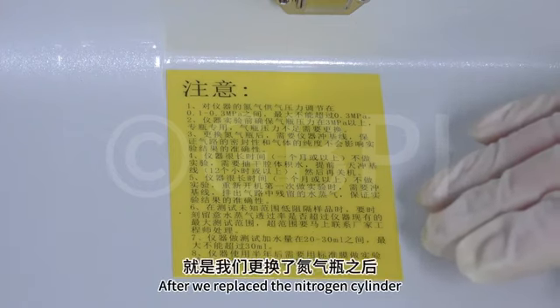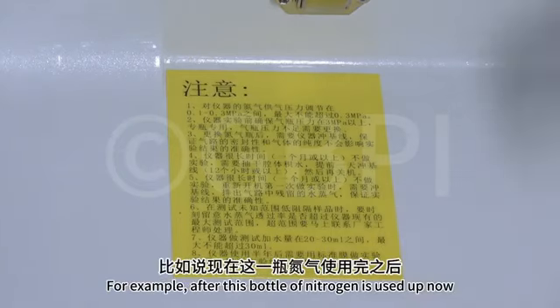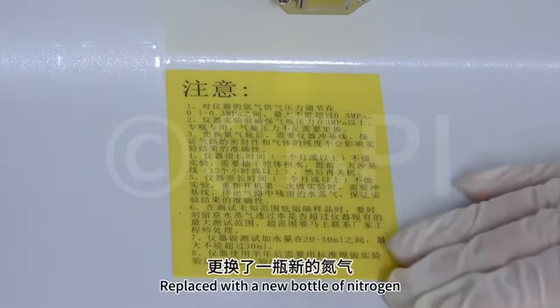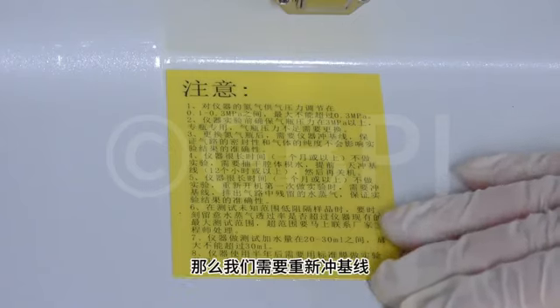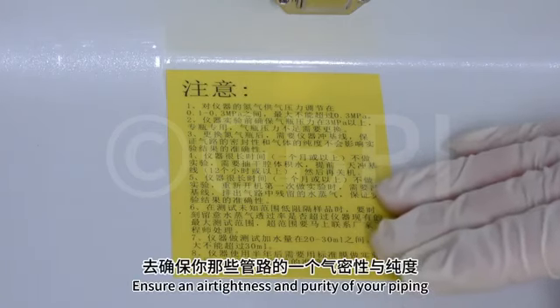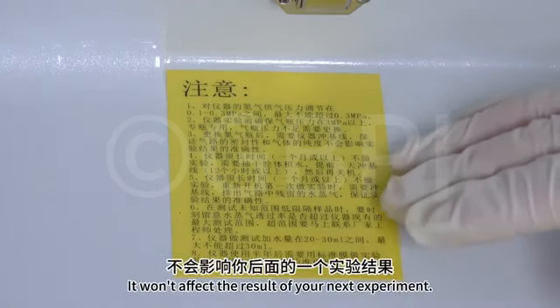After we replace the nitrogen cylinder, for example, after this bottle of nitrogen is used up and replaced with a new bottle, then we need to refill the baseline. This ensures the airtightness and purity of your piping. It won't affect the result of your next experiment.